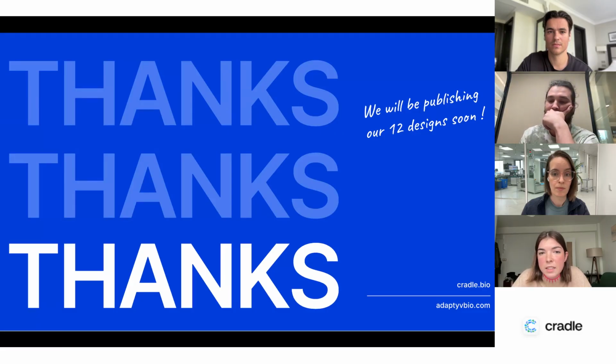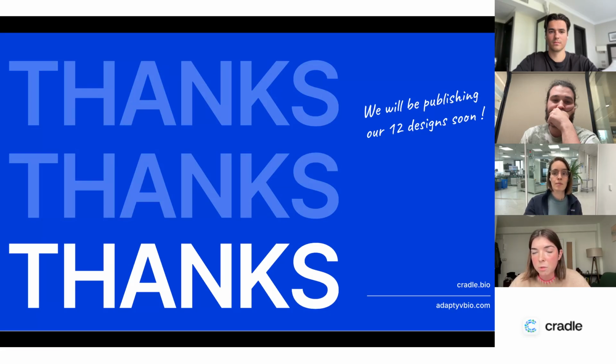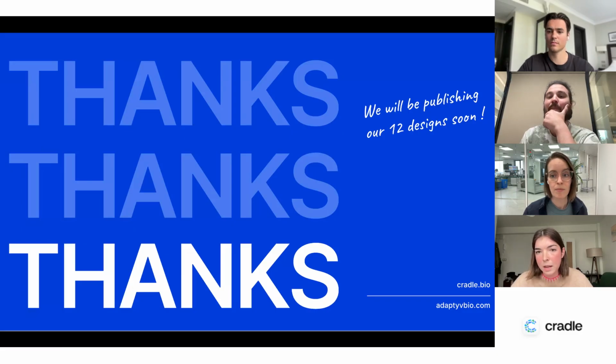So the way that we down-select is, as I said before, we don't select one sequence at a time. We're going to build a set, and we have certain constraints on that set. So the minimum number of mutations, and the fact that we don't always want to see the same mutations appear in that final set. The way that we diversify in zero shot is by not allowing certain mutations to appear too many times.